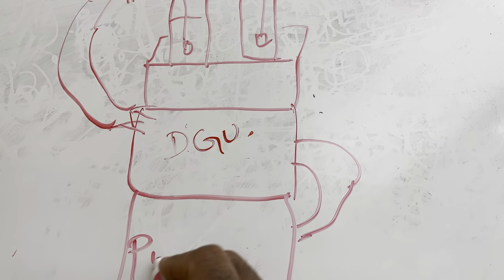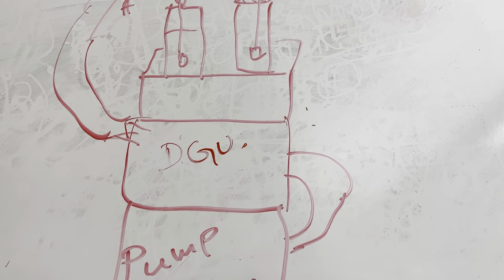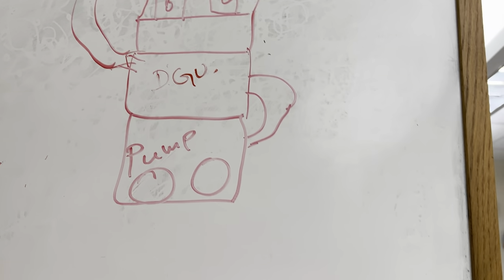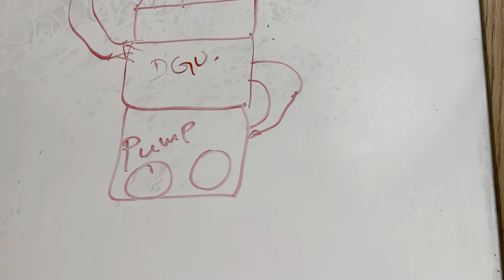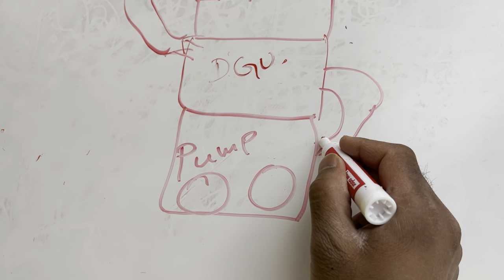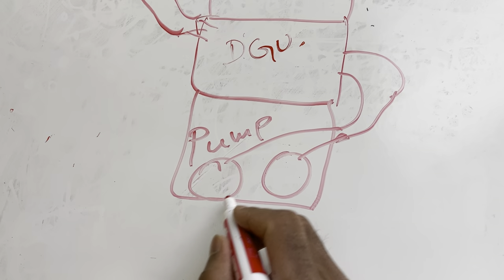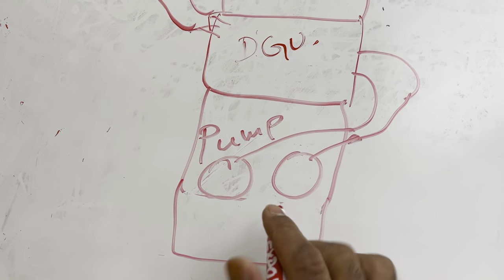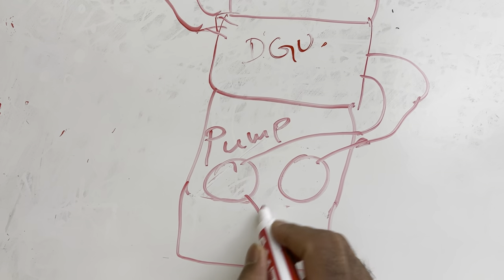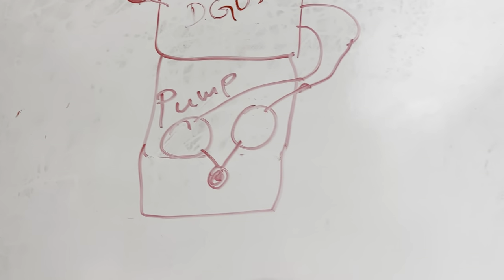In the pump section there are two pumps — a dual pump system. Two lines go to different pumps and then to one port to control the mixture of the solvent.